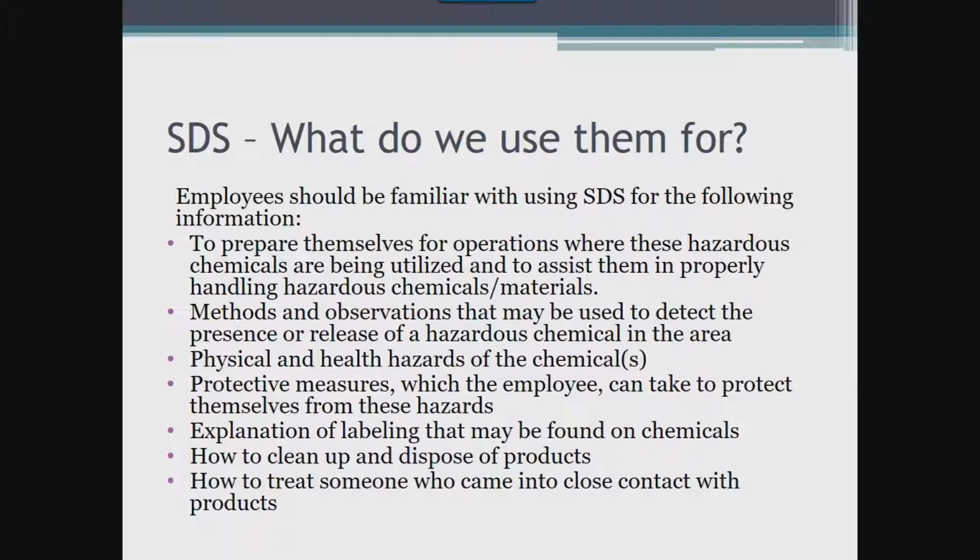It is important to note at this point that the safety data sheet is only as good as the use and review of the information you have available to you. At our organization, it is often a point of emphasis to the staff that for their own health and safety, they should be educated on these points of information and should heed all warnings given to them. We encourage staff to not take the "I'll be fine" or a less desired flippant attitude with chemical safety, to know what it is you are working with, and to follow all safety guidelines set out for them.